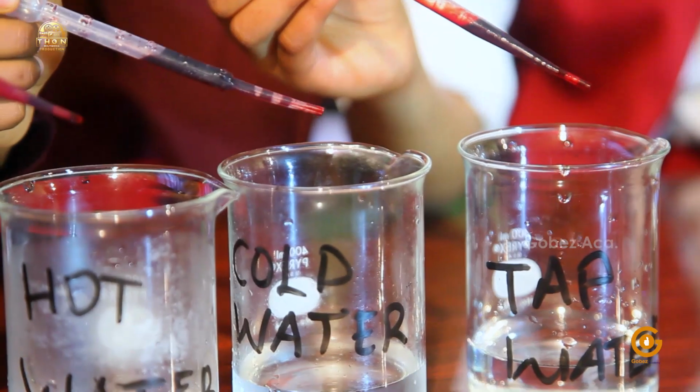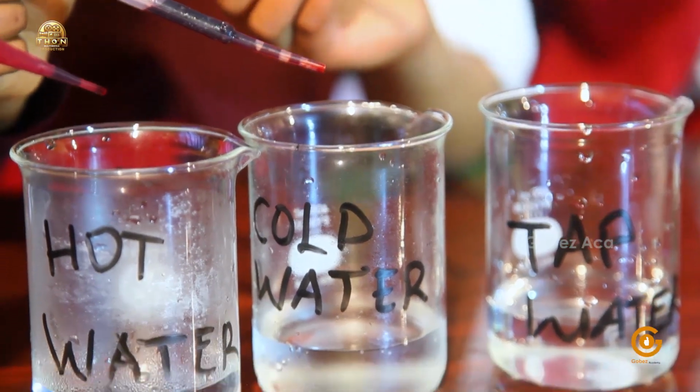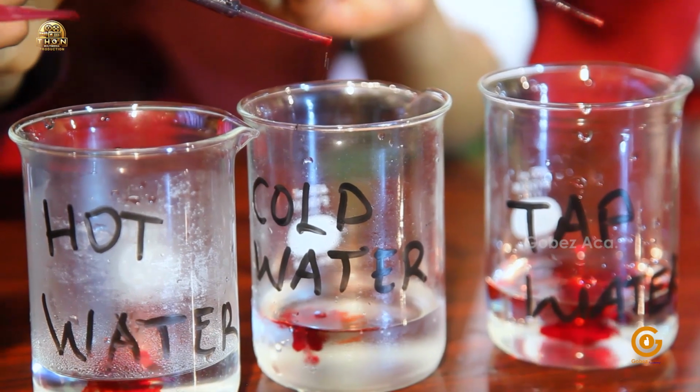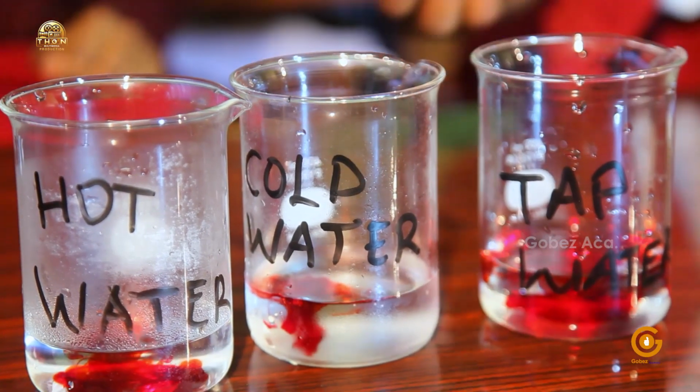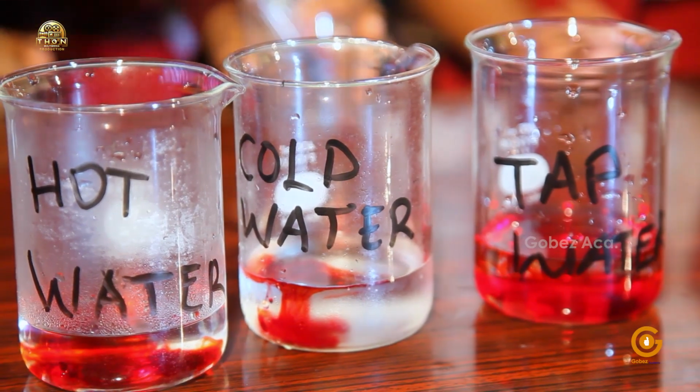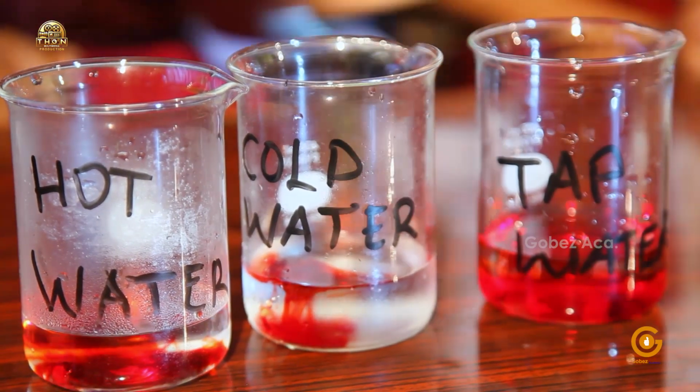We do this at the same time and see how fast the colored molecules diffuse. Now I put my timer to 1 minute and see the changes as they occur.